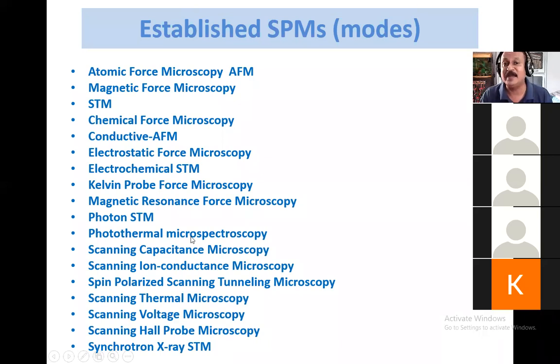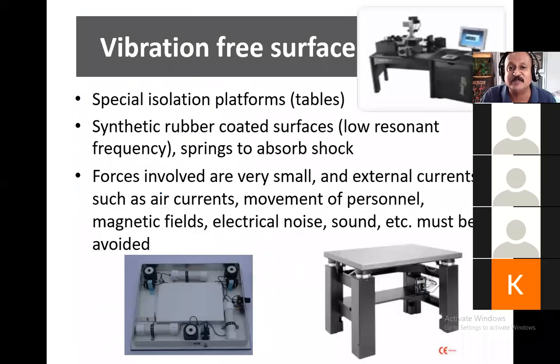Okay. And probably I have asked you one question. What was the question? Before that question, I want to tell you one more important thing: the probe is very fine, a very small, very thin probe. It is thinner than your hair.